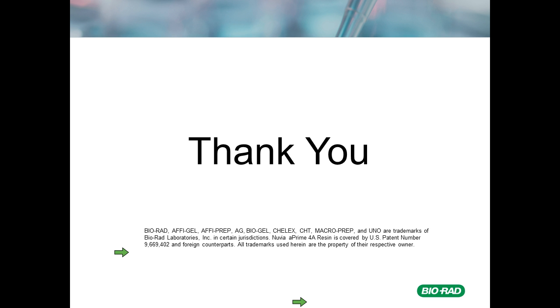What are some of the differences and advantages of using chromatographic methods such as hydroxyapatite versus the traditional methods like size exclusion chromatography? So there are a number of traditional methods, but the two that are most widely used are ultracentrifugation and SEC in some of the initial vaccine development programs that I've seen.